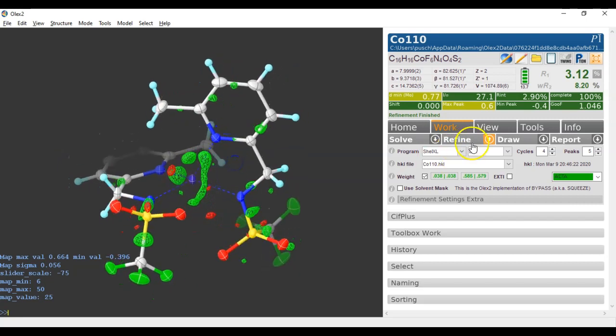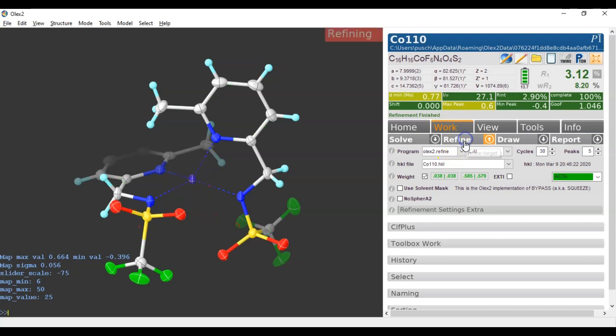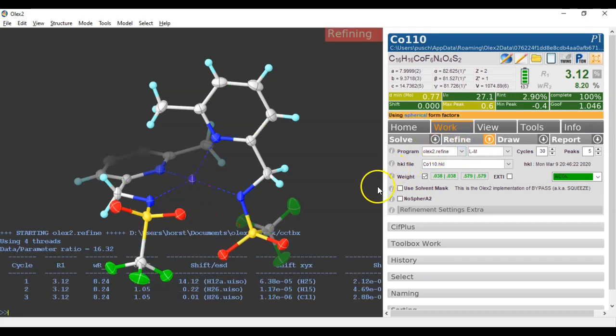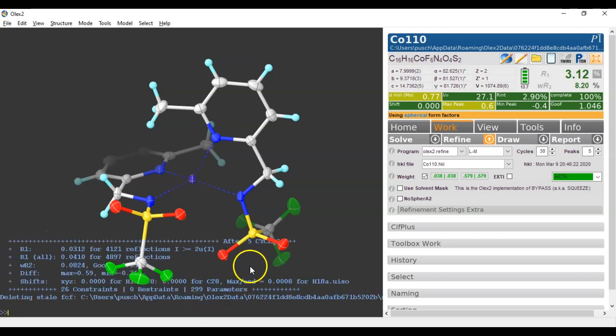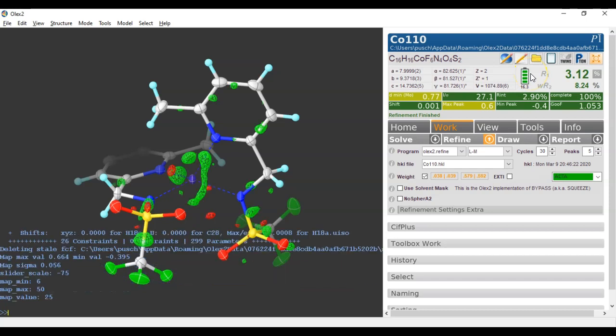Now you can also use Olex 2 Refine to refine the structure, and I'm going to up the number of cycles a little bit. We can in fact put as many as we like because it will stop when it's settled. When it's settled right now it will stop, and the R-vector will be exactly the same as with ShellX, and CTRL-M will be the same map as well.